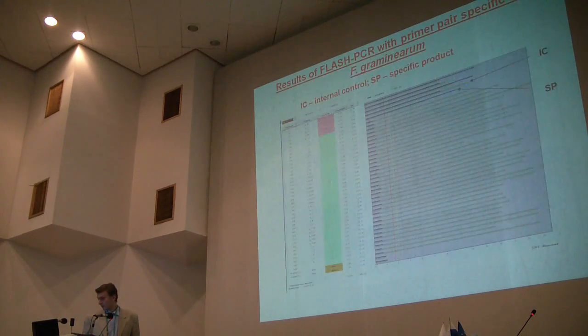And next, here you can see the results of FLASH PCR with the same primer pair specific to Fusarium graminearum. And here you can see a highly specific reaction with this primer pair with only Fusarium graminearum DNA.